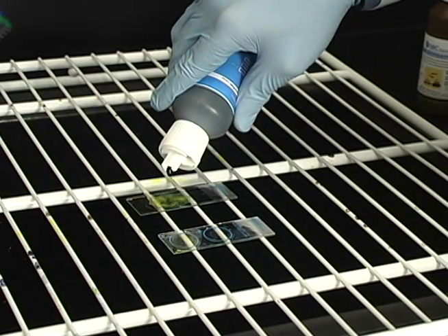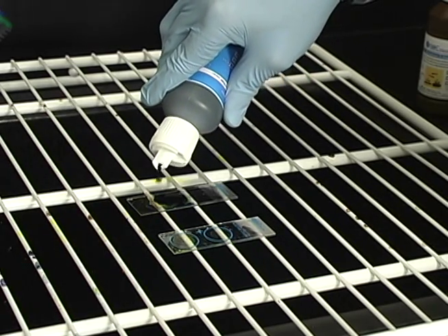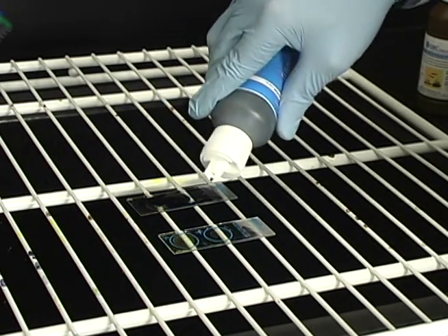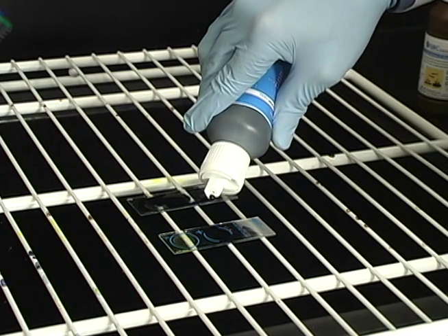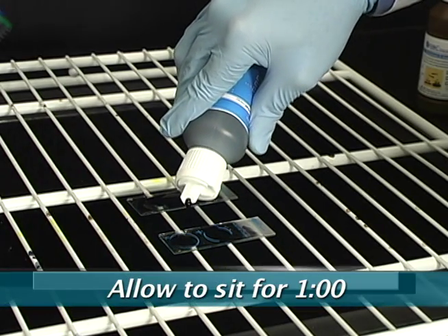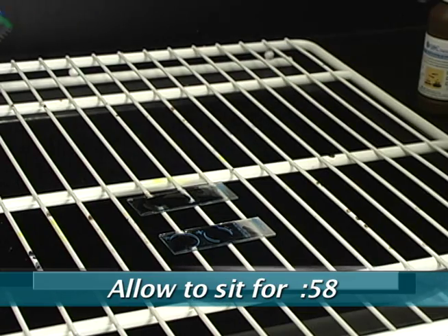To apply the FAST decolorizer quencher stain, dispense 8 to 10 drops or enough stain to completely cover the smeared area. Allow the slide to sit for 1 minute at room temperature.